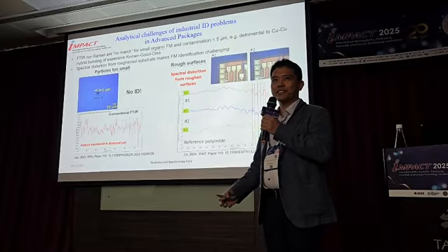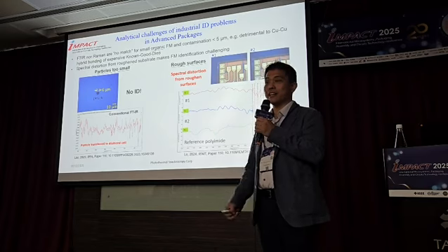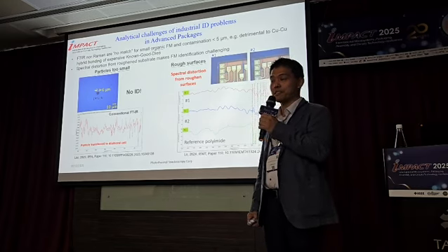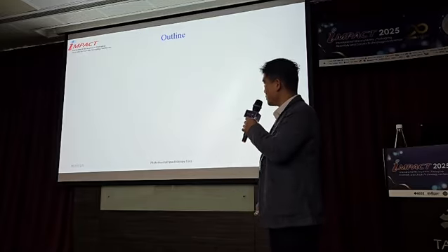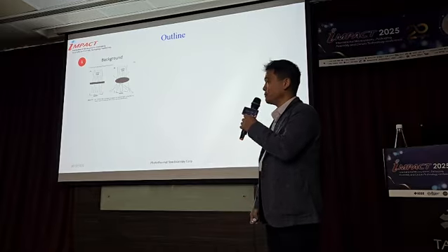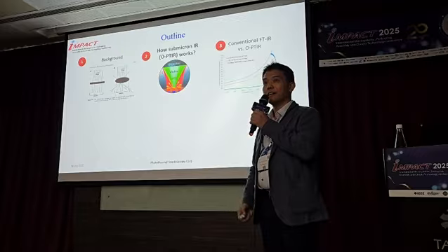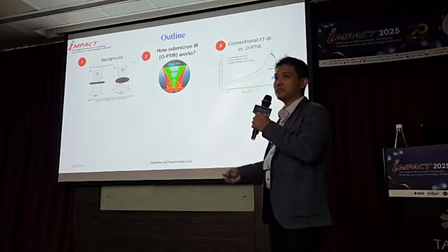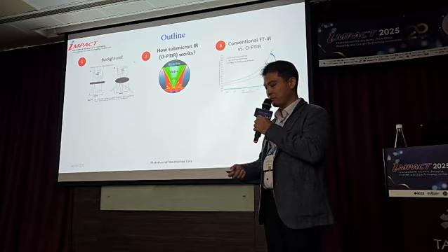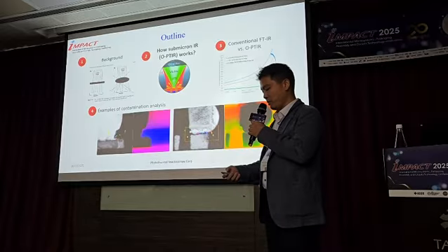But in recent times, things have changed a little bit, and I want to share how we can actually go about analyzing these small contaminations using infrared spectroscopy. But I do have to go through a little bit about how it actually works. So first, I'll tell you a little bit of background about infrared spectroscopy to begin with, and then follow that with how submicron IR or O-PTIR works. And then follow up with a couple of examples showing how it actually works.